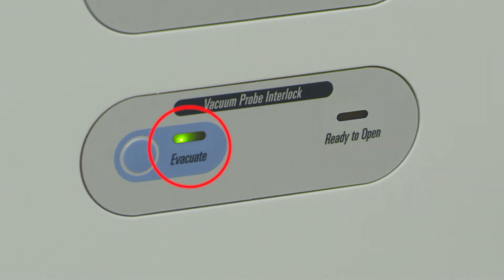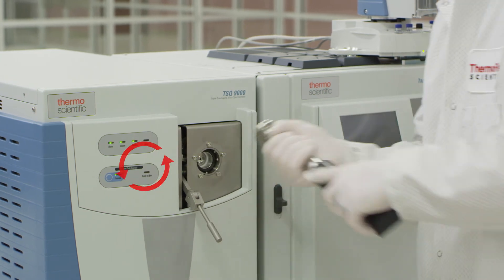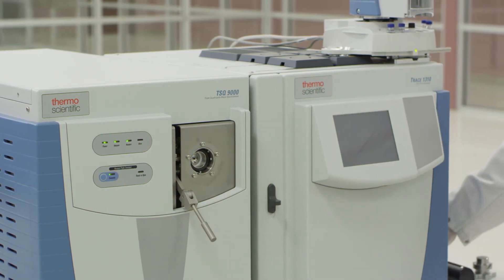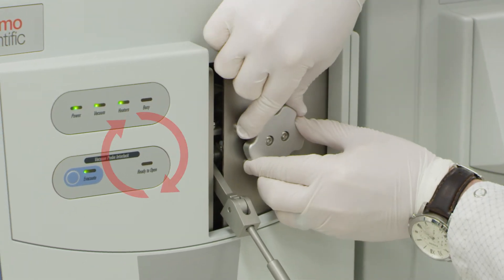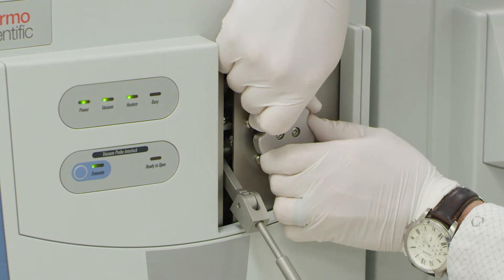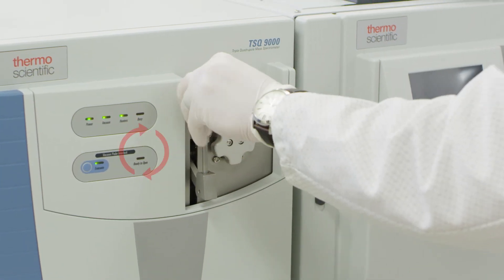The evacuate light is now green again. Remove the source installation tool by turning counterclockwise. Replace the manifold cap by inserting and turning clockwise until the cap clicks. Return the lever arm to the upright position and secure.